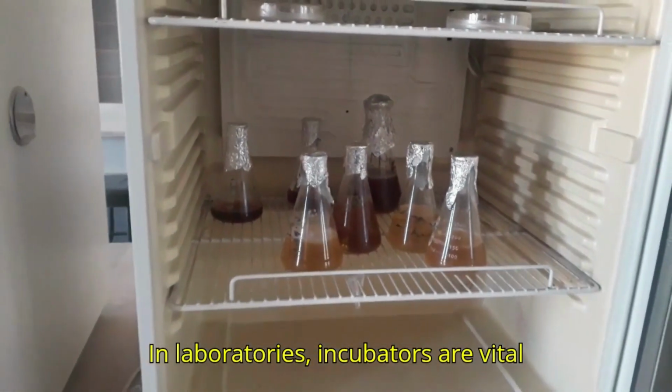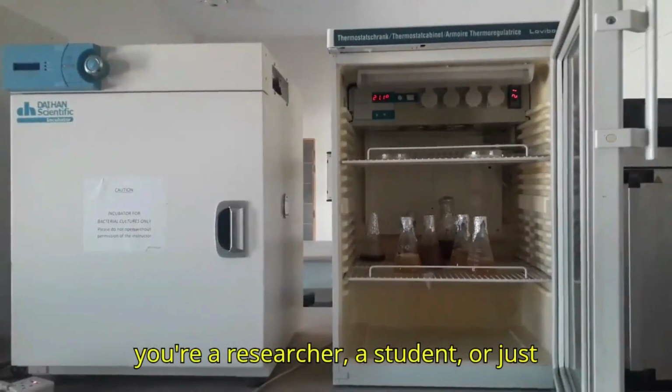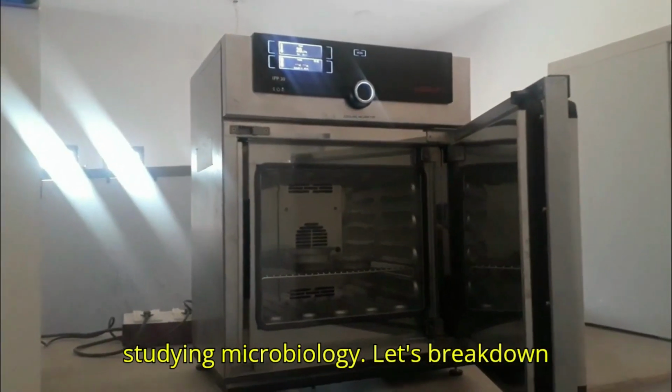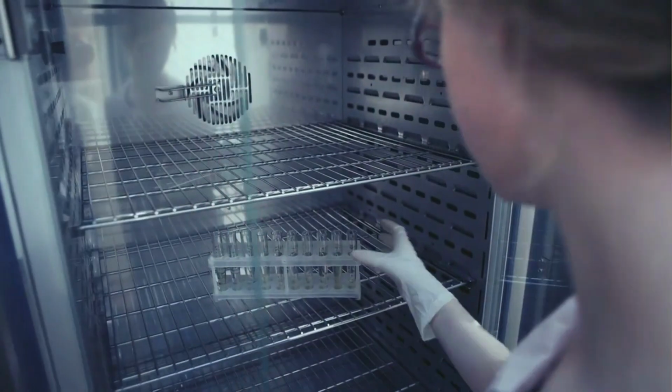In laboratories, incubators are vital tools for growing microorganisms. Whether you're a researcher, a student, or just curious, understanding the purpose and function of these devices is key to studying microbiology. Let's break down the basics of microbiological and BOD incubators.